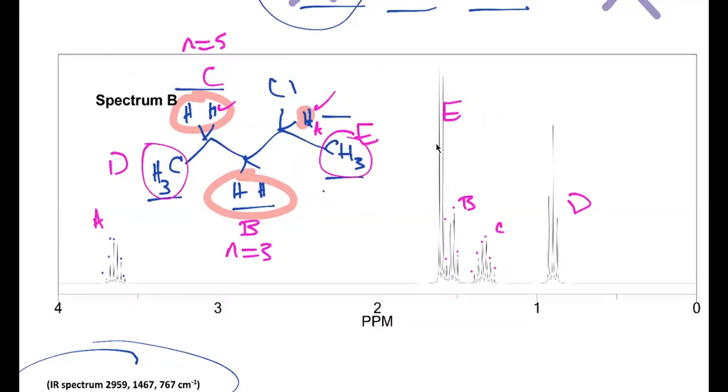On that video I sent Wednesday, the last example talked about that, about how even when it's not necessarily a scenario where you have a chiral center or an alkene or some other functional group that causes multiple non-equivalents, you still have it. But when you do the splitting tree, you see that some of your lines end up overlapping. So for these examples, we just apply the N+1 rule and just leave it at that.